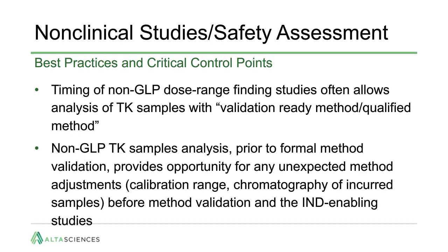When the timing of non-GLP dose range finding studies allows for analyzing TK samples with a validation-ready or qualified method, proceeding with the analysis at this stage is recommended. The sample results will provide opportunity for unexpected method adjustments, such as calibration range or chromatography adjustments, to be implemented prior to formal validation, and the sample analysis for the IND-enabling studies.